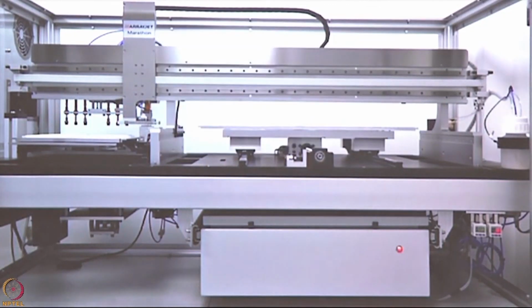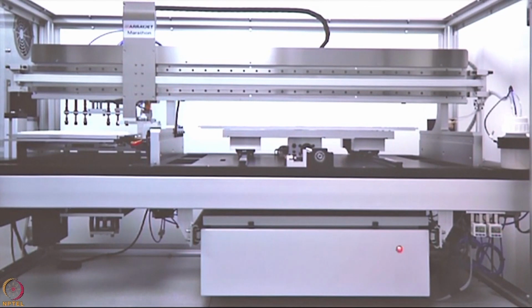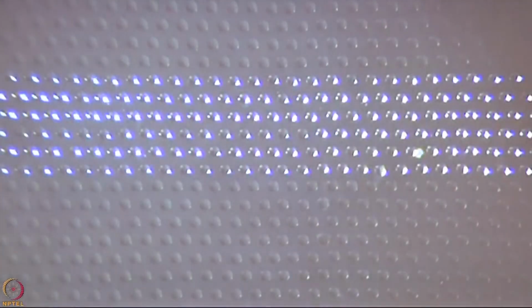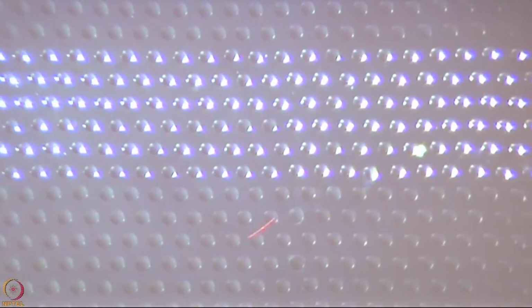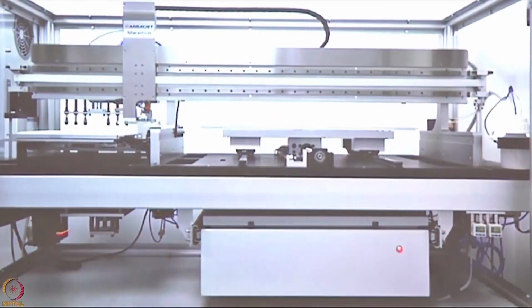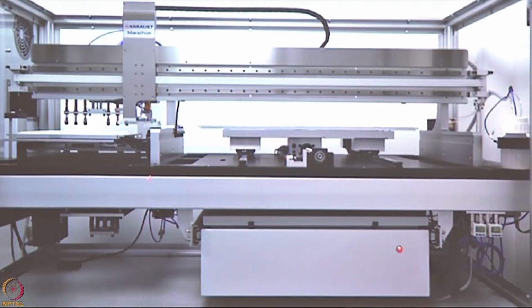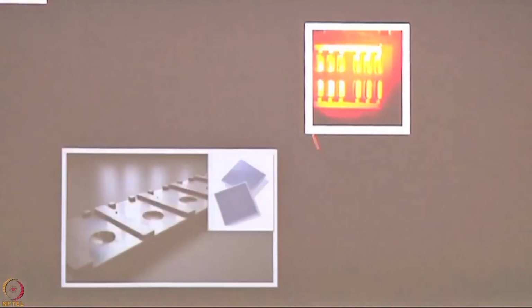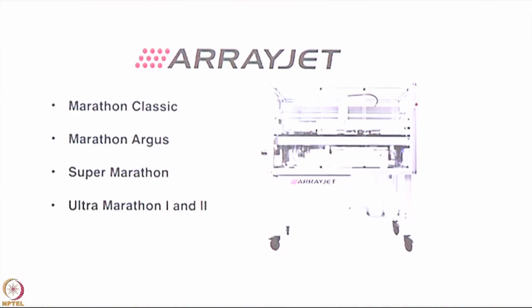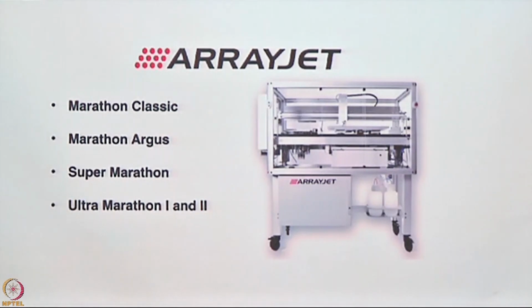This is the washing cycle. This is where the washing happens. And once the washing happens, which is the bit which takes some time, because it's very critical to wash your one set of 12 samples to avoid any contamination, we want to make sure these are some of the spots we've printed with label-free technique. And I believe they are not printed on a slide, they're printed on a completely different surface. So, you have a slide, you have a multiplex slide, you can even go as big as a plate, so each ELISA can happen on a plate. You've got chips, if anybody is doing microfluidics work or any of the lateral flow techniques, they can all be transferred.